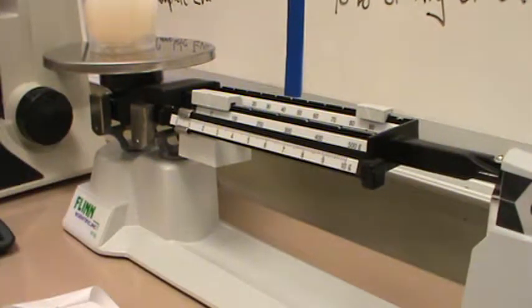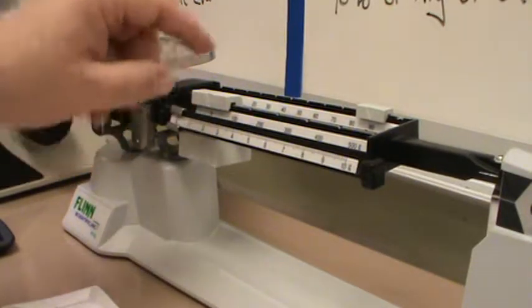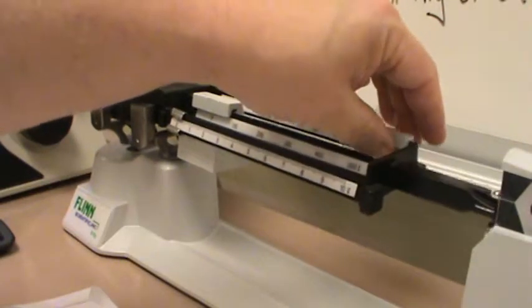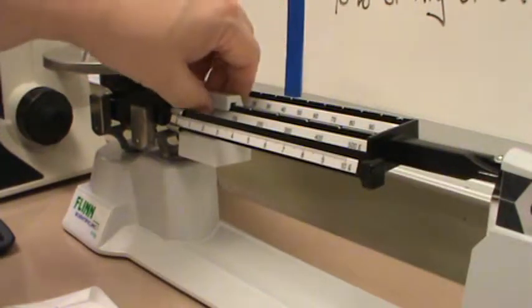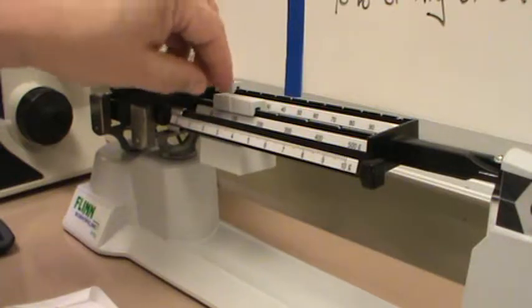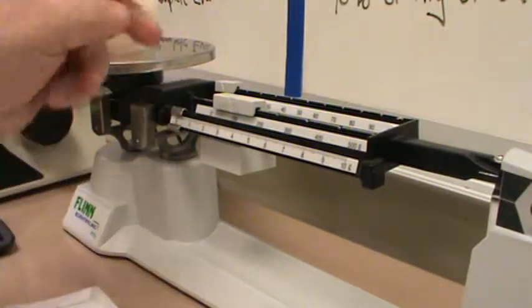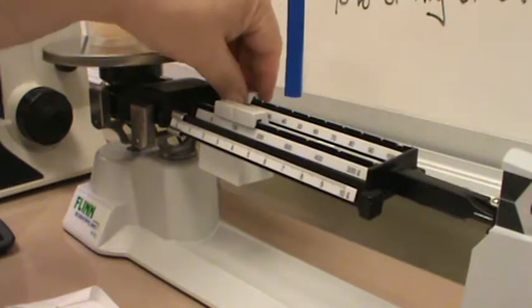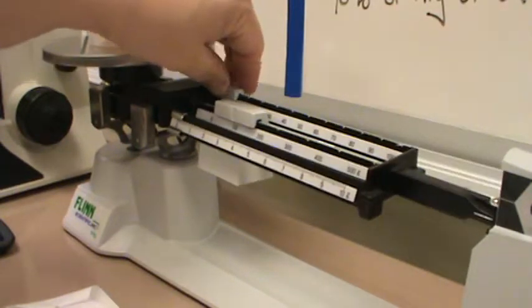And nothing's happening. So definitely we have increased in mass. So let me run this up here to 100. Ooh. We've increased quite a bit. I thought 1 or 2 grams would be the increase, and we're going to be more than that because we're at 100. Let me run this to 110. Definitely more than what we need.